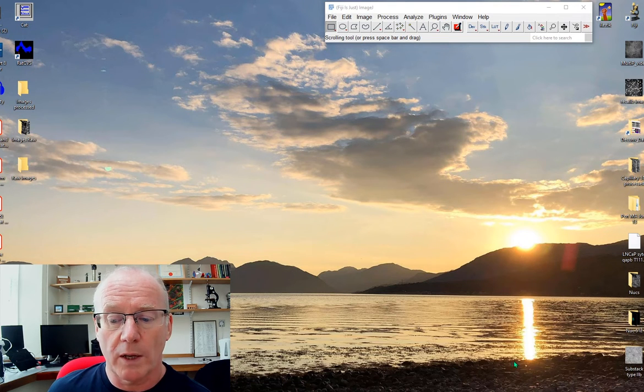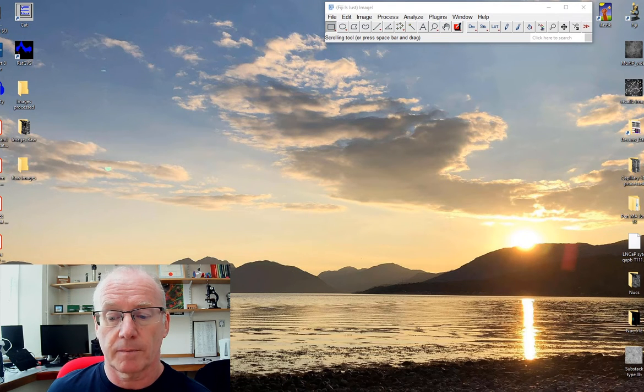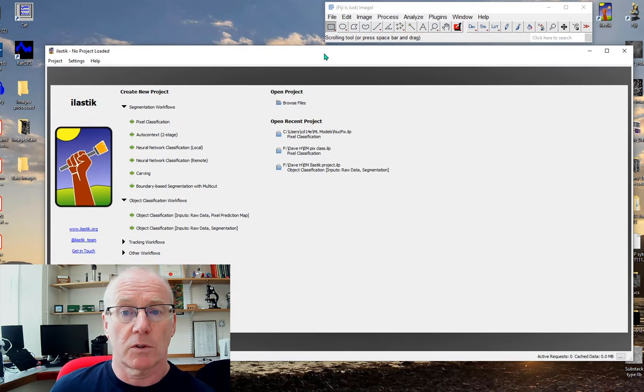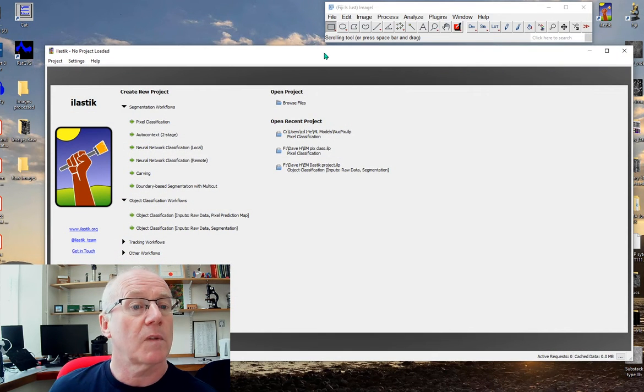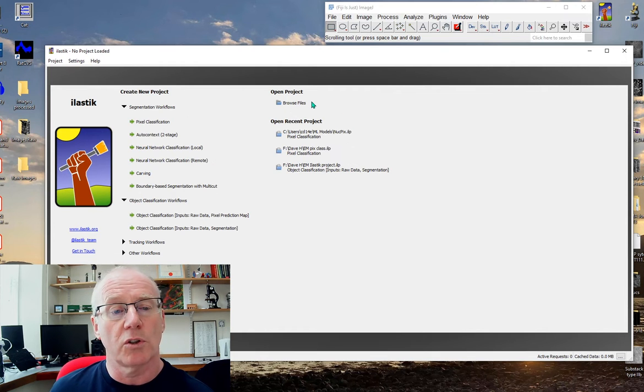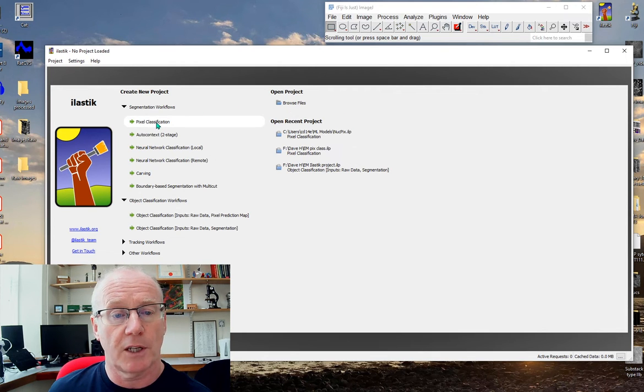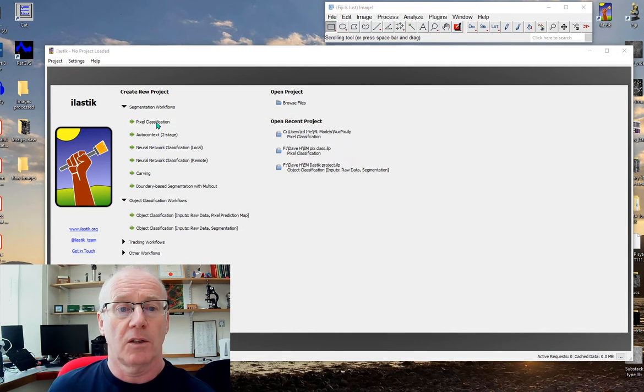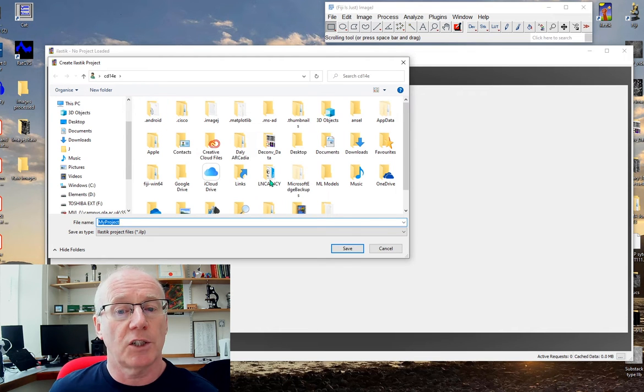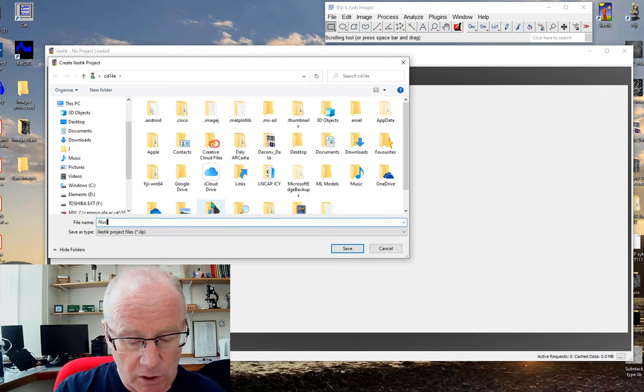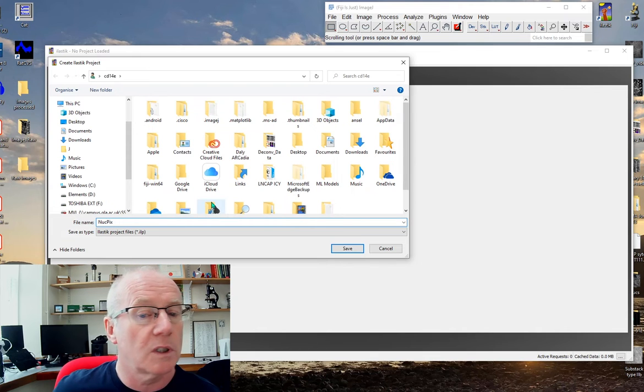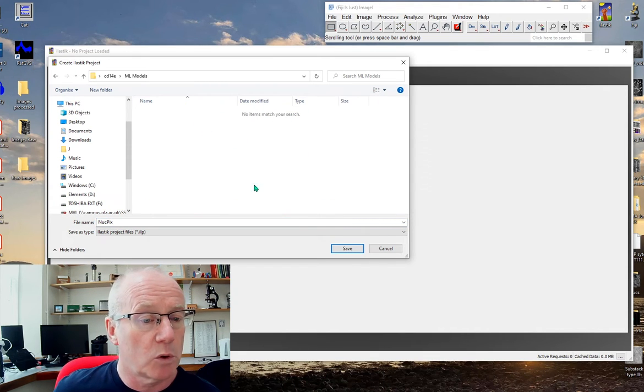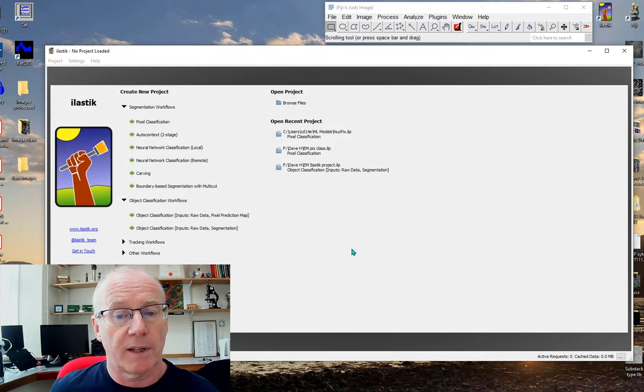When you run Ilastik it's going to look like this once it starts up. The first thing we're going to do is a pixel classification. We're going to train a network based on pixel intensities. We'll choose pixel classification and give it a name of nuclei pixels and put it in my machine learning models folder.